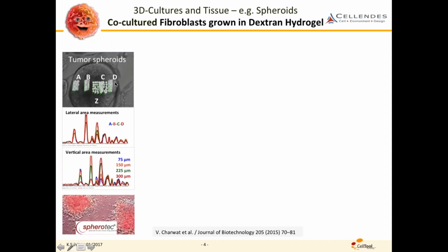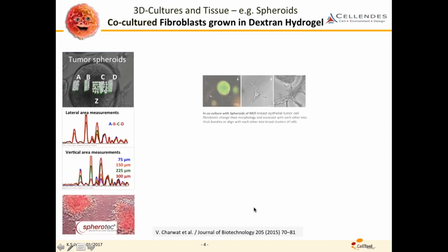And the idea is now, instead of what is currently done, take these spheroids, fix them, cut them into slices and do the routine tissue analysis. We just go into the living example, show how drugs, for example, go inside from the side, how they penetrate, to see whether drugs are already arriving in the center part, or are they still only at the outside, which gives a lot of help, especially in the drug developmental part of the pharmaceutical industry, to see how their cocktails react in the real or the more likely situation in the body.